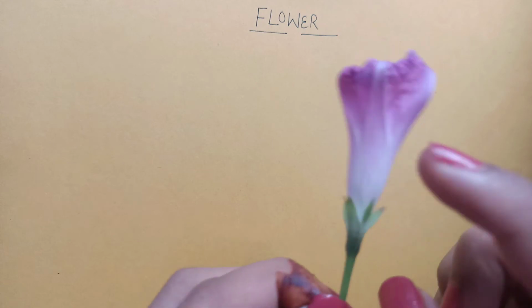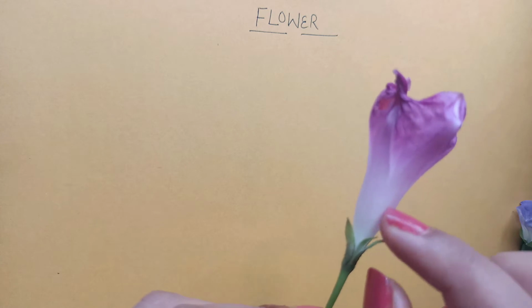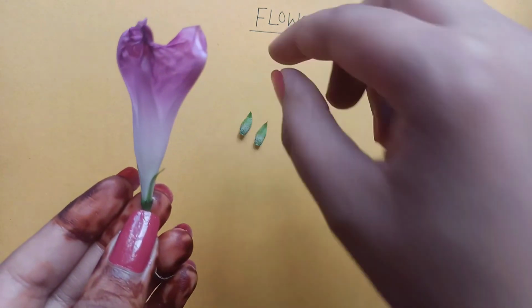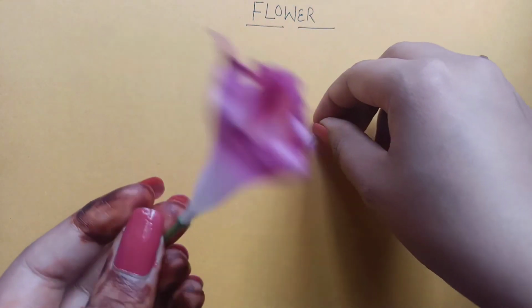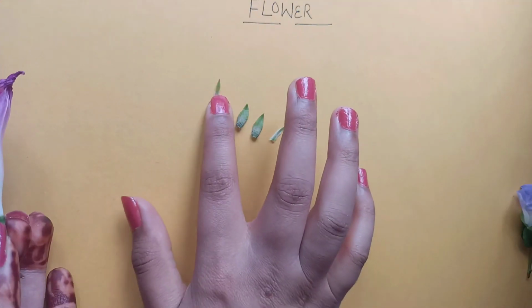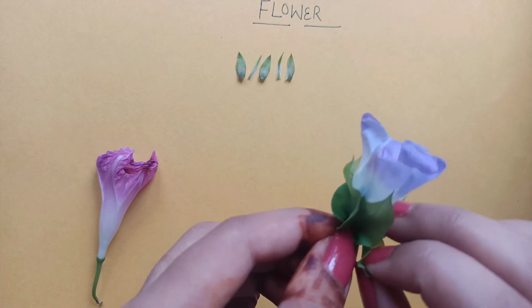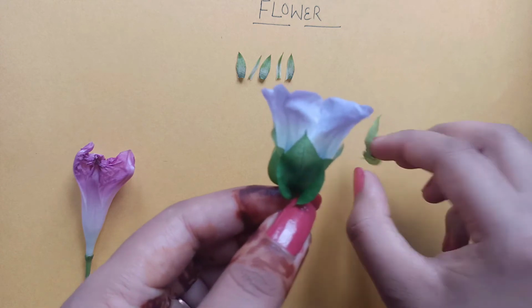You can see these green colored, leaf-like structures are known as sepals. Each one is a sepal. If I remove this, this is one sepal, this is the second sepal, this is the third sepal, this is the fourth sepal, and this is the fifth sepal. So these are sepals. Similarly, you can see over here the sepals of this plant. We can remove these also. We have to be a little bit careful while removing them. This is one.